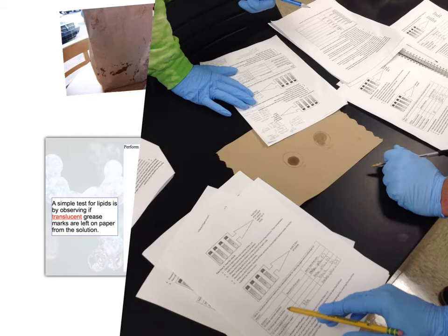And so with the Sudan IV, you are putting this substance, the Sudan IV reagent, into the oil, and it is mixing with the oils and it is turning them a pinkish color. It's actually drawing out the fats from the actual sample. But it is highly carcinogenic. It is not a test that we need to use to actually see whether or not we have a lipid or not. The paper bag test is definitely perfect.